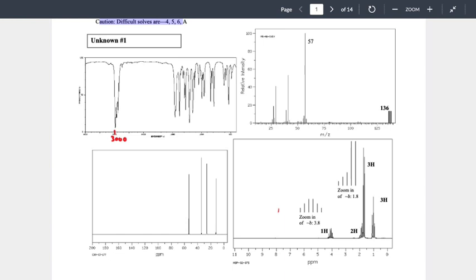So what we might want to do is come up with a way to ensure that we can actually see that appropriately. The best way I have found, on an exam or on this worksheet, is to take a second sheet of paper. The second sheet of paper has a 90-degree angle on it, kind of like this board. And so what you can do is align the base of the board with the bottom axis, and then align the other one with your 3,000. Are the peaks greater than or less than 3,000?